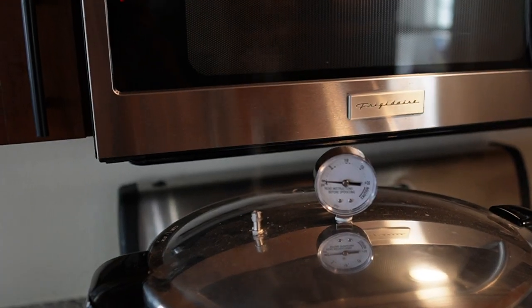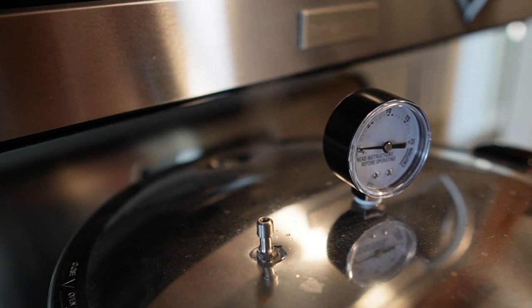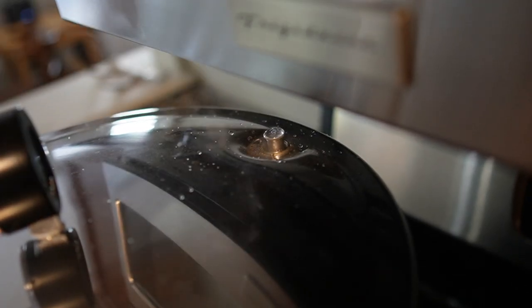Once the lid is secured, turn the burner up to high heat. After a few minutes, steam will start to be released from the vent pipe. Once you have a steady stream of steam, set a timer for 10 minutes. At this point the pressure gauge will still read near zero, which is totally normal. The airlock will pop up, signifying that pressure is starting to build — at this point do not open the pressure cooker, as it is super dangerous. Always read your pressure cooker's manual in depth before using one, and never open it if there's pressure inside.